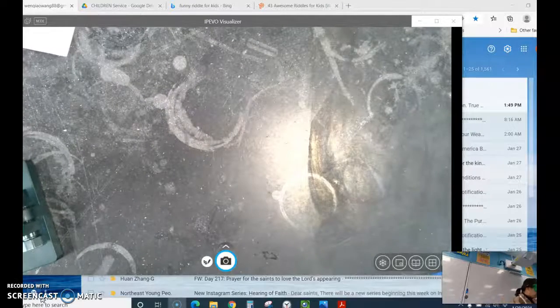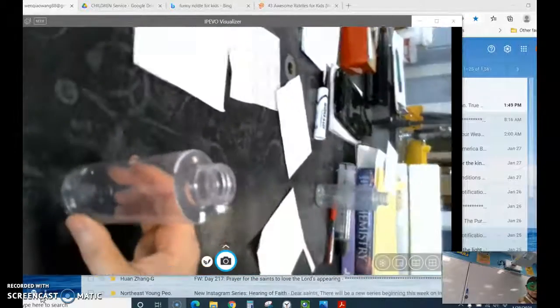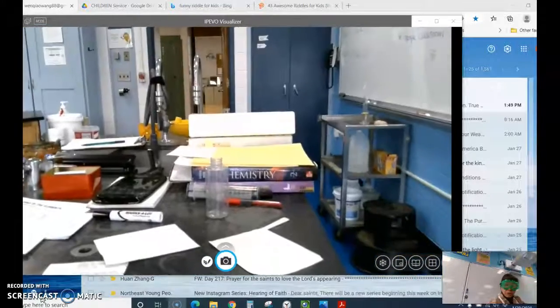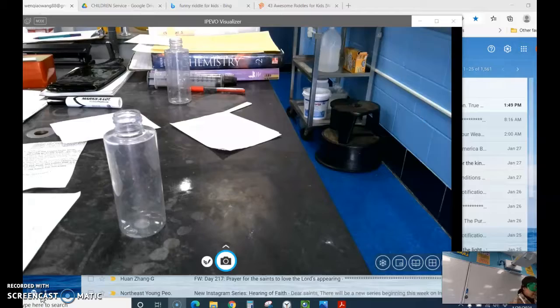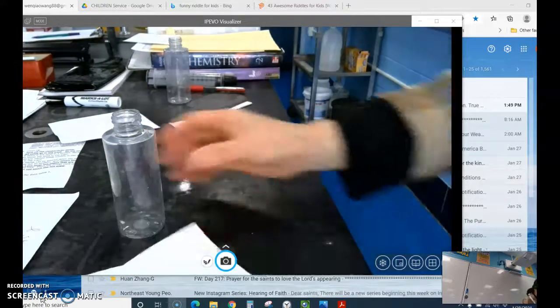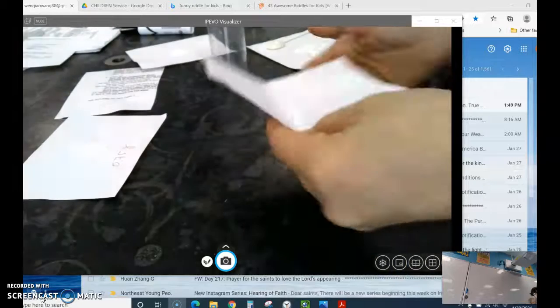Okay, so the device we use, this one is a bottle. I'm going to turn the direction this way, so you can see carefully. Can you see better? Oh, this one is better. So I'm going to use this bottle, I have 2 there, but this one, okay. I'm going to use this bottle to put in the baking soda. The first one I'm going to put in is, can you see this one? 0.25 gram. So I'm going to put this one in.